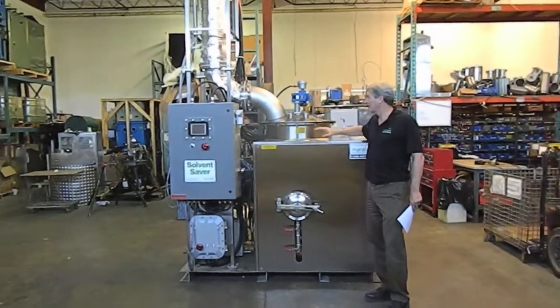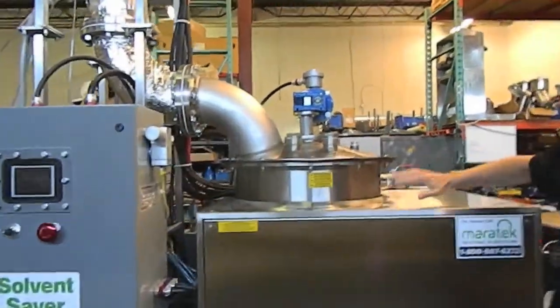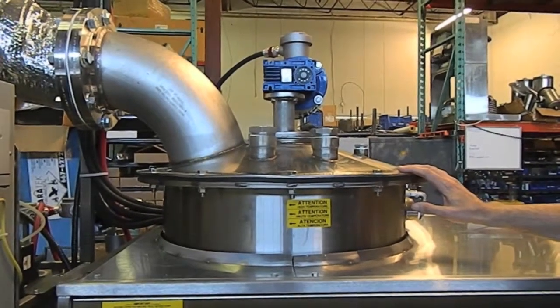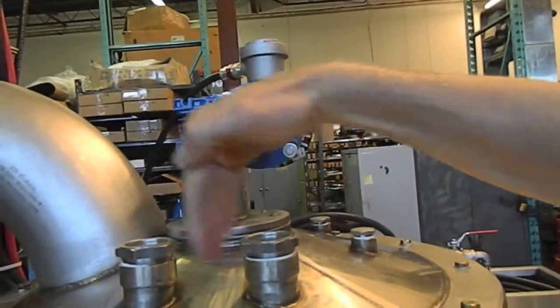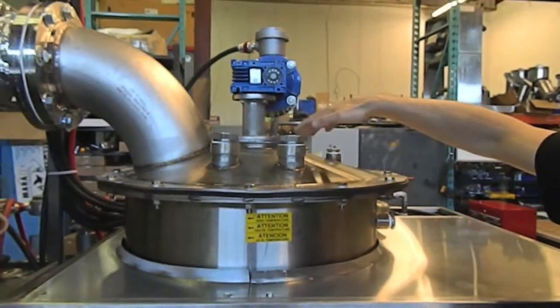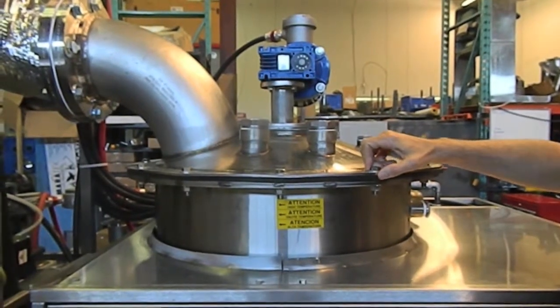The way our units work is it has a distillation vessel — this is a 50-gallon distillation vessel, and it's all made with stainless steel components throughout. This one specific unit has a scraper, and what it does is it goes around to keep the walls of the distillation vessel clear of solids so you have a more productive and efficient boiling process.